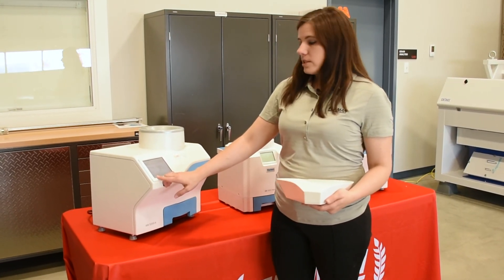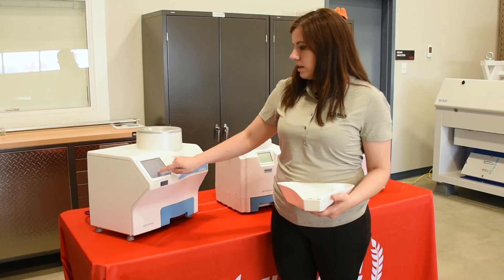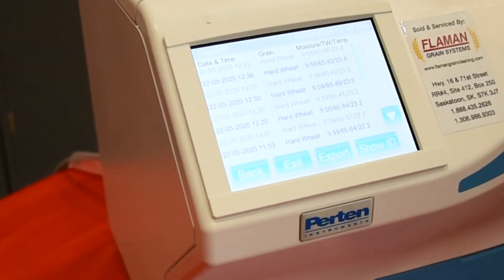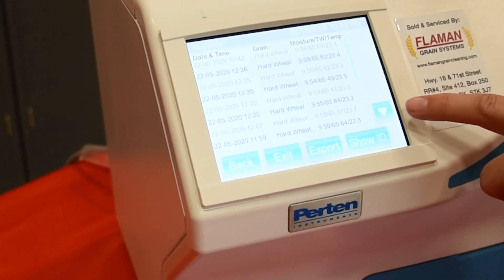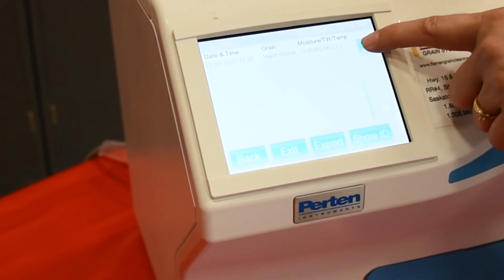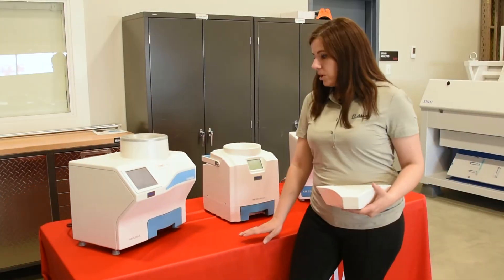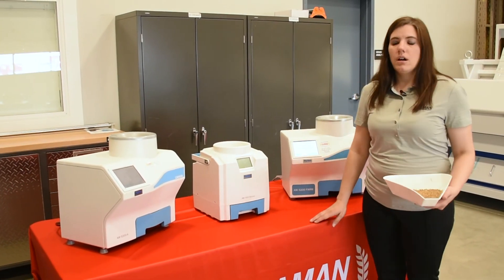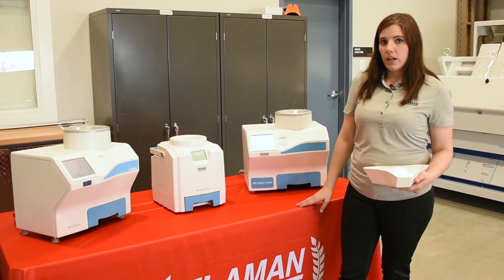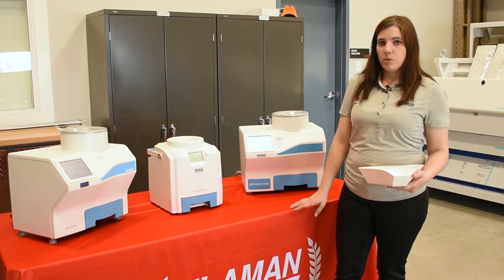All results are displayed by just pulling up a report, which shows all of the tests you have done by whatever filter you put on it. All of these units will test high-temperature grain hot off the dryer and keep an accurate and repeatable result.